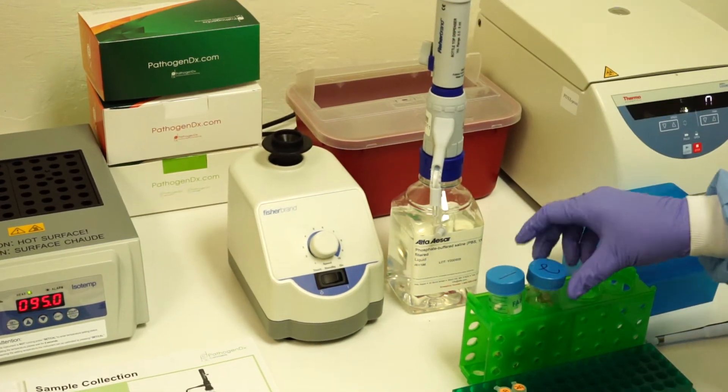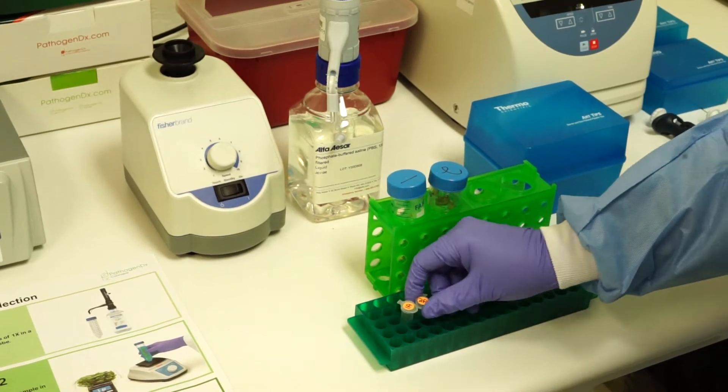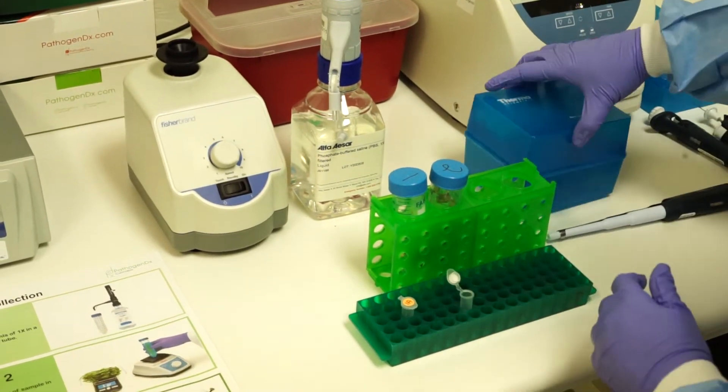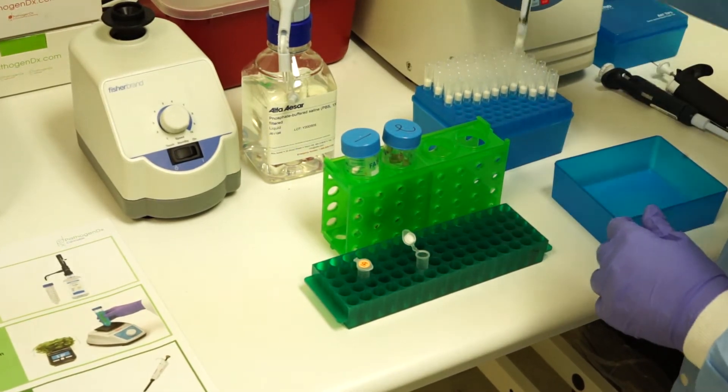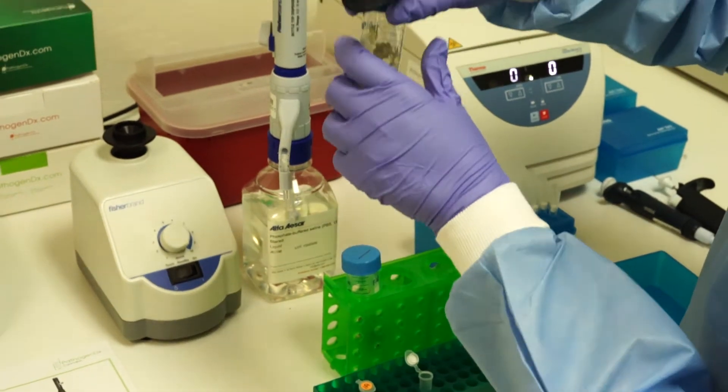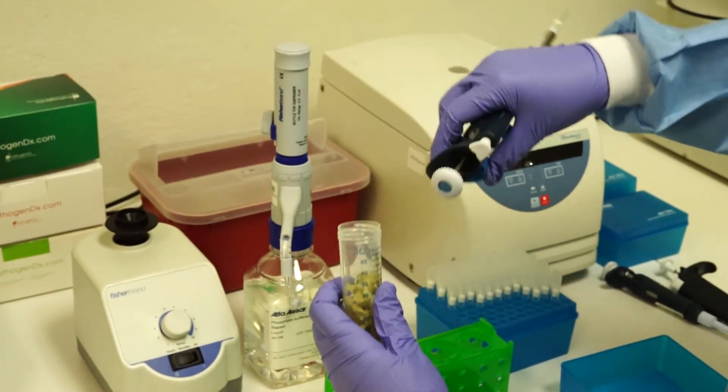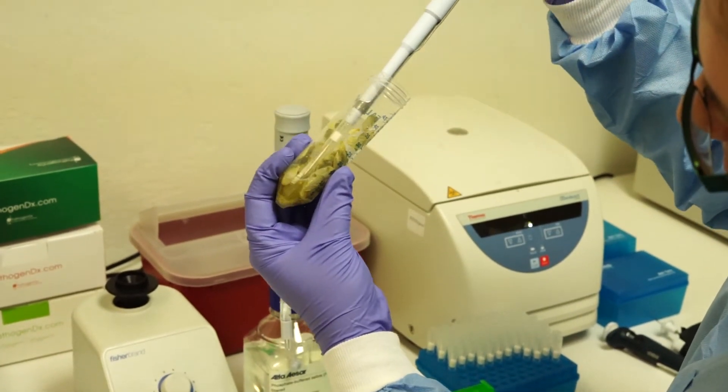Once you've mixed your sample, transfer 1 ml into the appropriate 1.5 ml tube. Make sure your pipetter is set to 1 ml and carefully remove 1 ml of solution by avoiding as much plant material as possible.